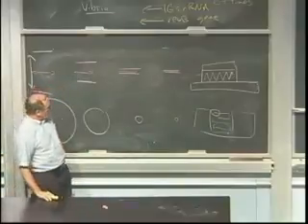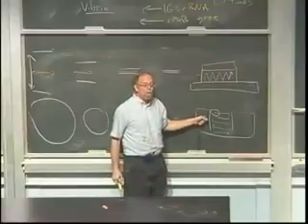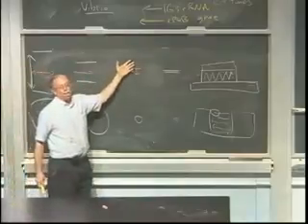Maybe 2 minutes at the beginning, okay? But it's actually very quick. If you don't have the specimen, just make another slide, okay? No sense wasting your time. Your time's precious, it's valuable. So just move on, okay? Always start with this. I think that's the number one thing that students don't want to do because you say, after all, I'm working at this power, so why not start there? It works much better, lower power, okay?